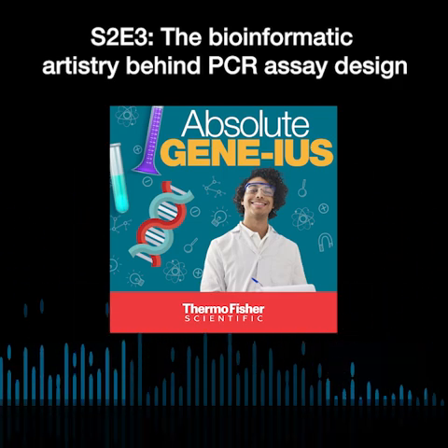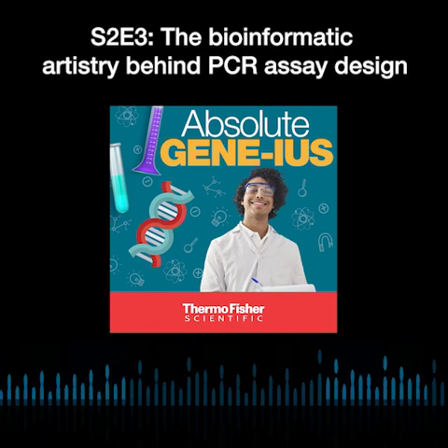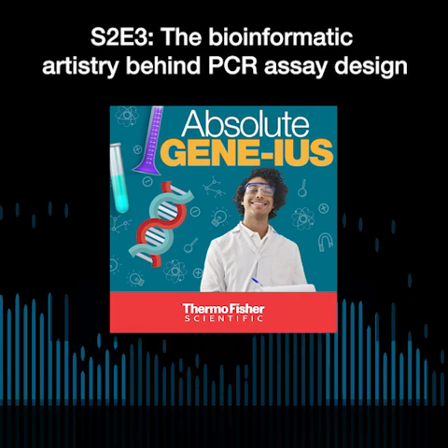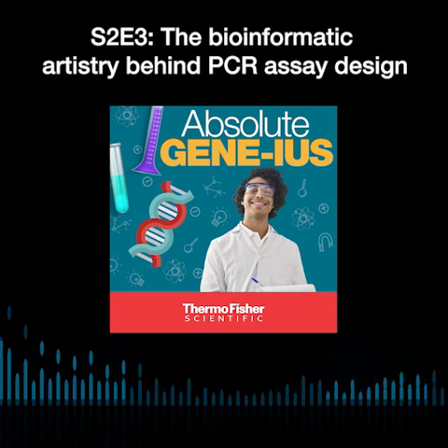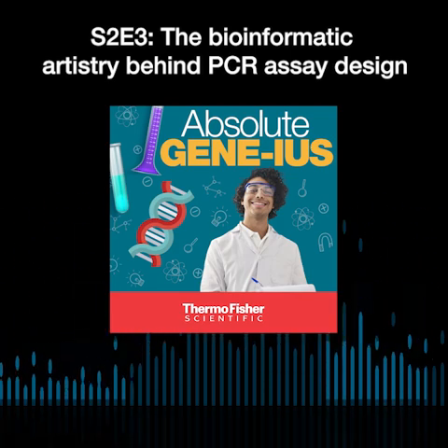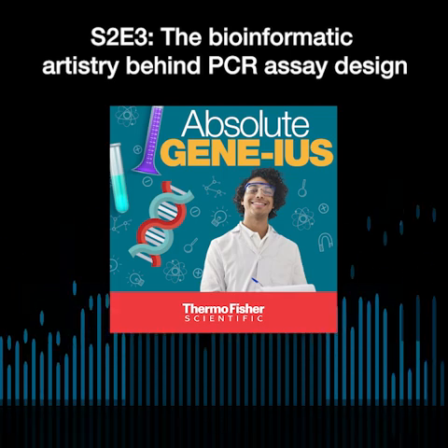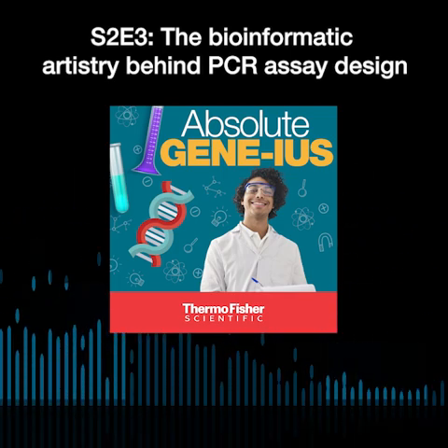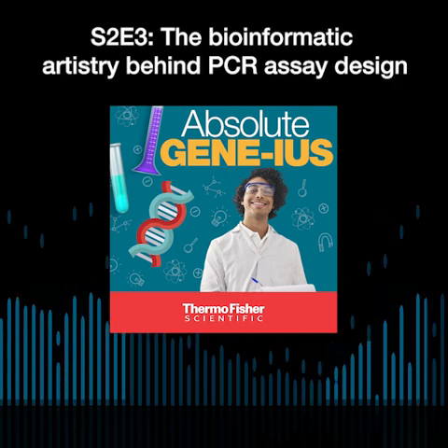We did a design and tested it in the lab, and it seemed like both the wild type and the mutant were lighting up. My molecular biologist counterpart came to me and said that the assay is not specific.